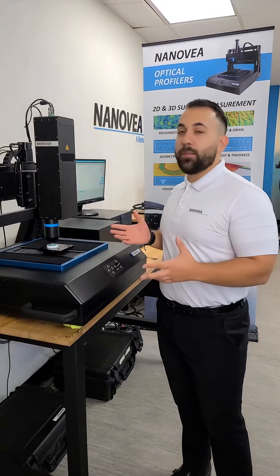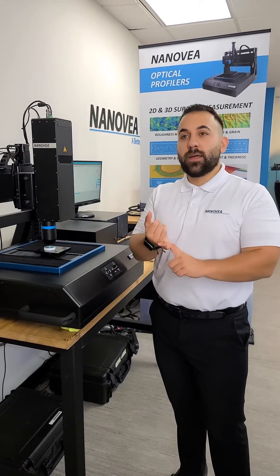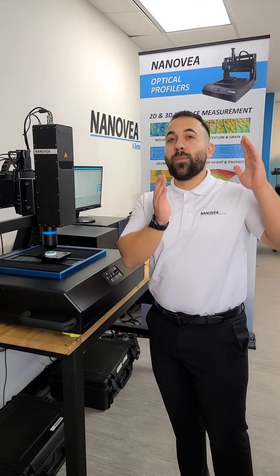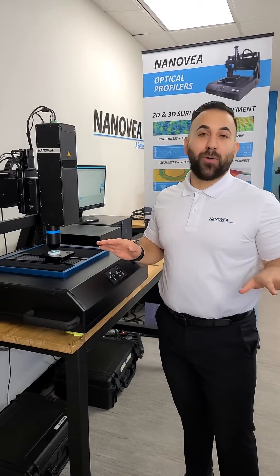The cool thing about our profilometry is we're in a lot of different industries, whether that be aerospace, medical, or textiles. We are also in local manufacturing shops. If it has a surface, we can measure it, point blank.